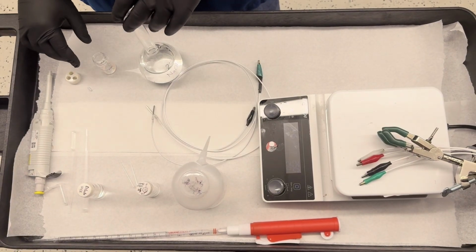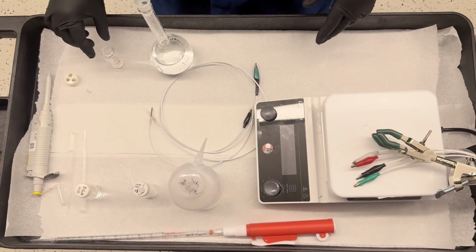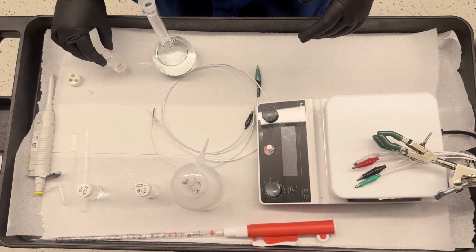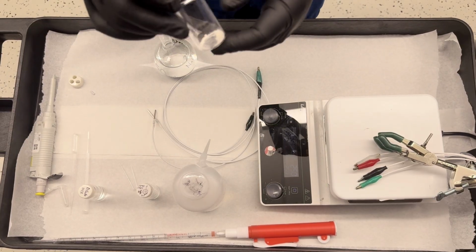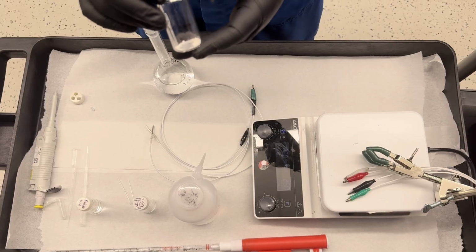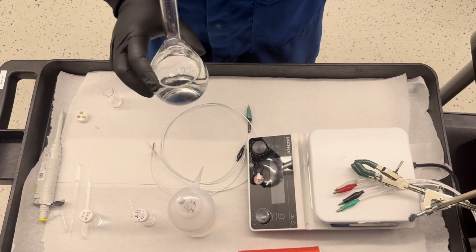In this video, we will demonstrate how we synthesize aminopyralid from picloram dehalogenation and how we set up the reaction in alternating current mode. For that, we first take picloram and measure around 100 milligrams, and we will now add the electrolyte, which is 2% sodium hydroxide, into it.